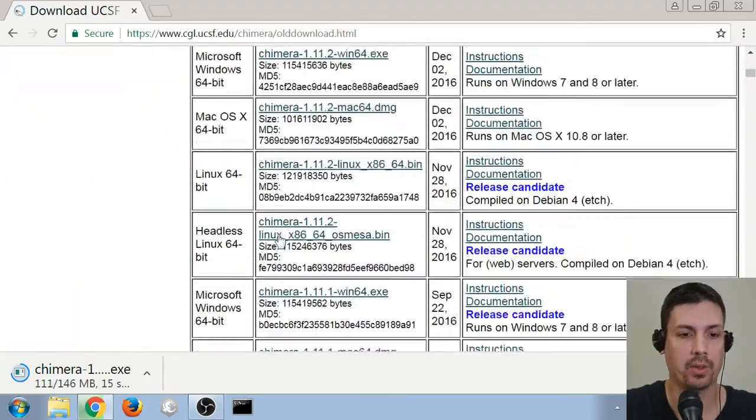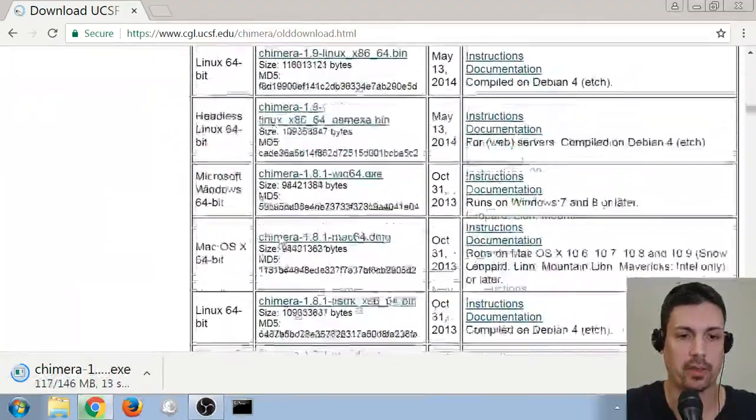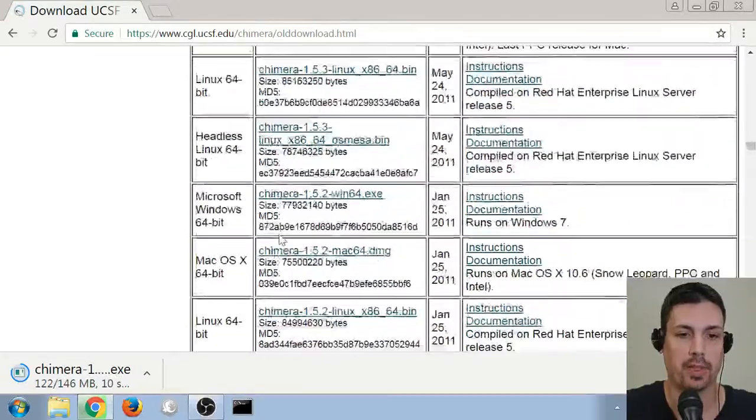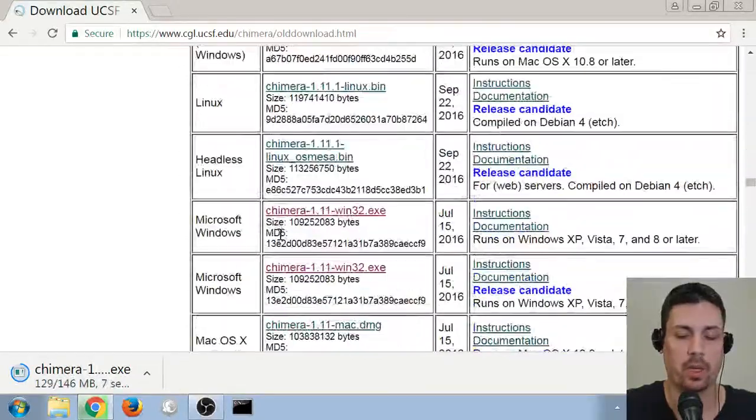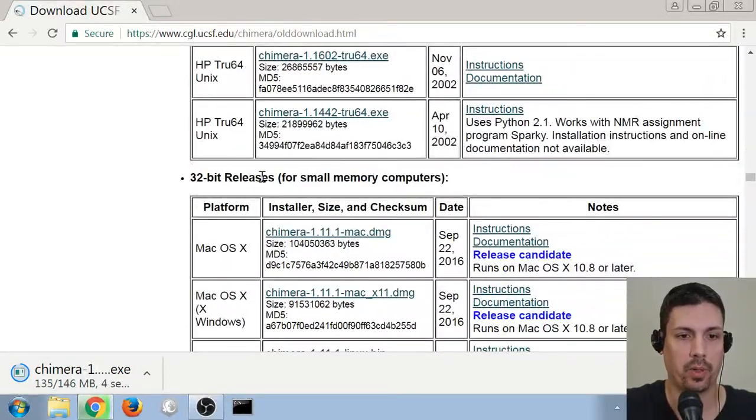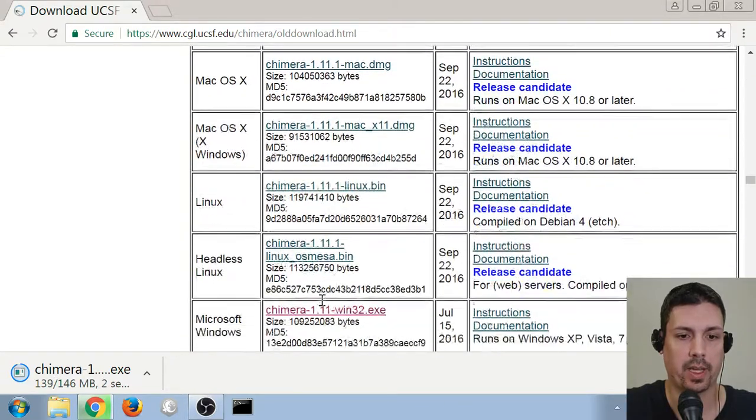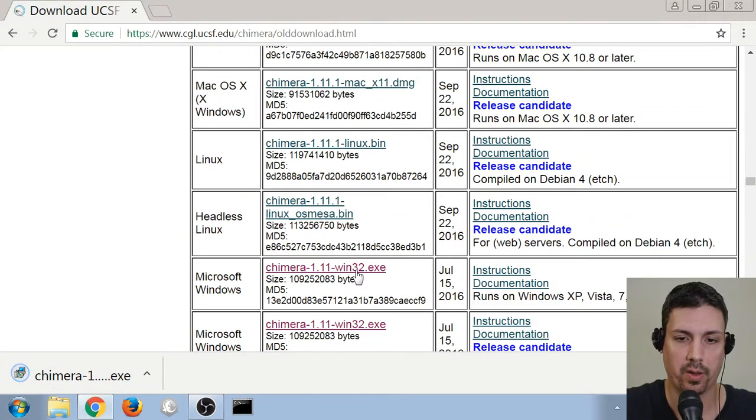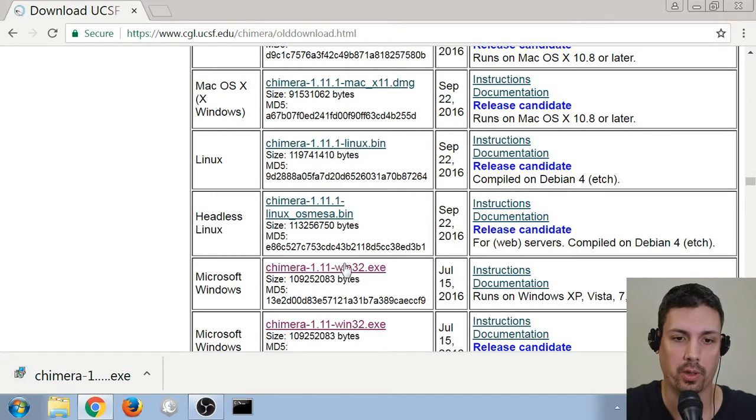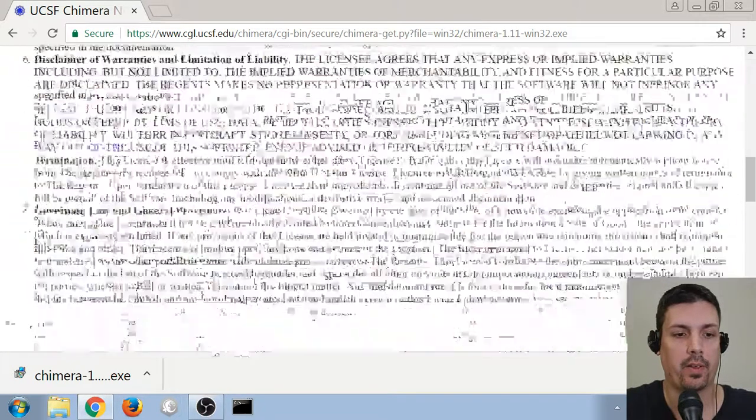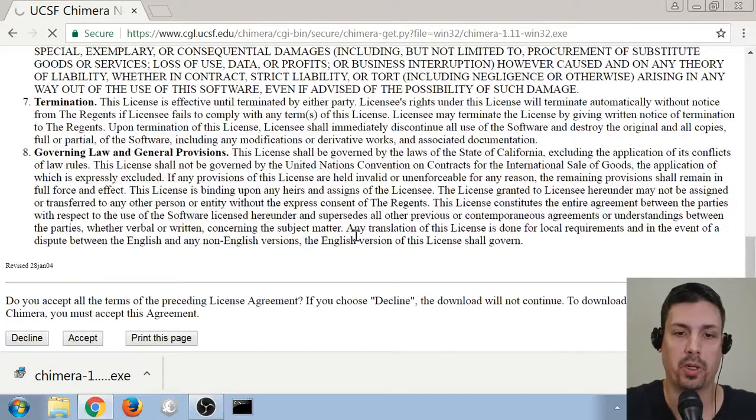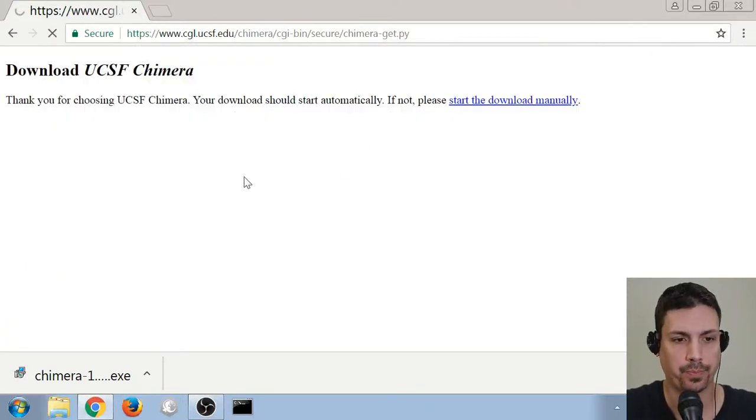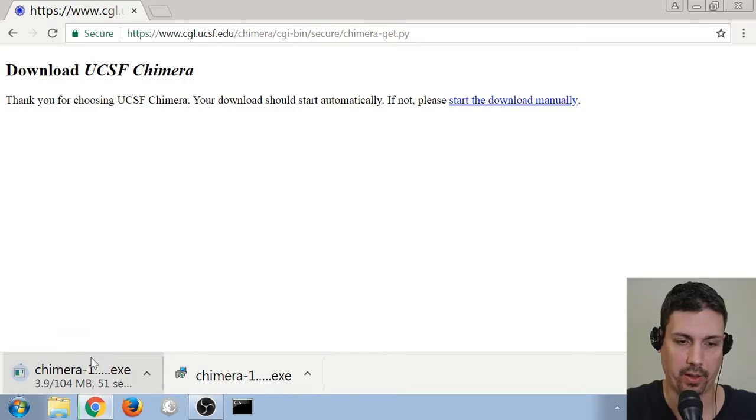And then we need to scroll down to the 32-bit software section. So there's a lot of 64-bit versions, but we just passed 32-bit releases. We scroll down just a little bit, and we get to the first Microsoft Windows version that says Win32. This will run on older computers, so if you're not sure or you're having trouble running the 64-bit version, I highly recommend downloading this version in the same way and saving it to your computer.